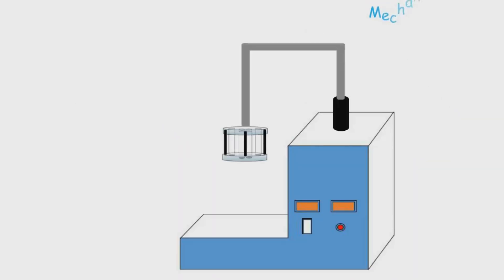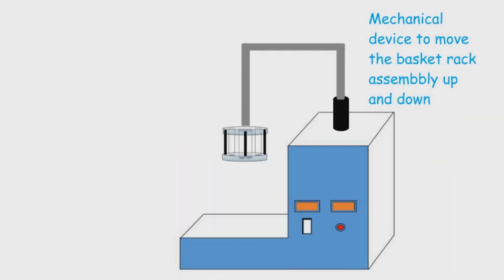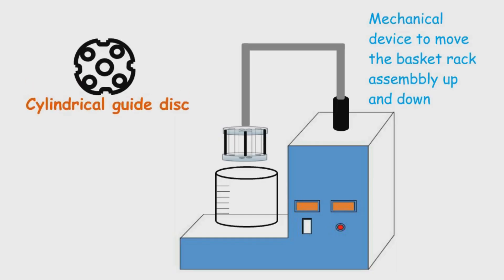As we can see here, the central rod of the basket rack assembly is connected to a mechanical device which moves it up and down for the disintegration test. There is a beaker having a capacity of 1 liter in which we fill the media specified in the monograph and observe the disintegration of the tablet. We also have a cylindrical guide disc with a diameter of 20.7 mm, which has five holes — four at the periphery and one in the center — each with a diameter of 2 mm.